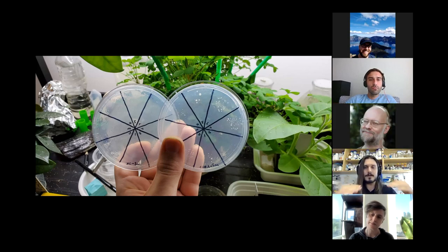Right. It's a little hit or miss, and the colony sizes are different because we're working with starvation as the main selection pressure. But the amount of antibiotics that you don't need would be wonderful, because there's a lot of places that want to do biotech, especially in schools.